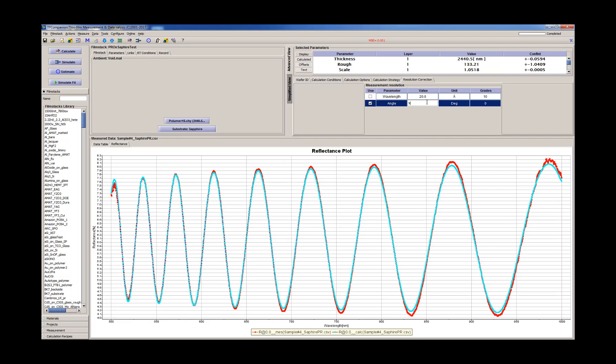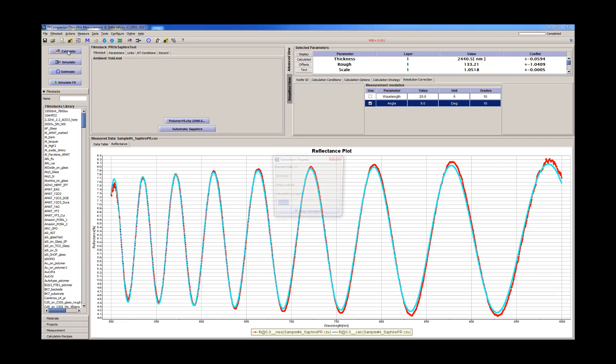We have about 9 degrees conversion aperture. And there's a little effect. So angle effect about 1 nanometer. So for very accurate measurements we can use this angle correction. It makes calculation a little slower, but it gives a little bit more accurate results.